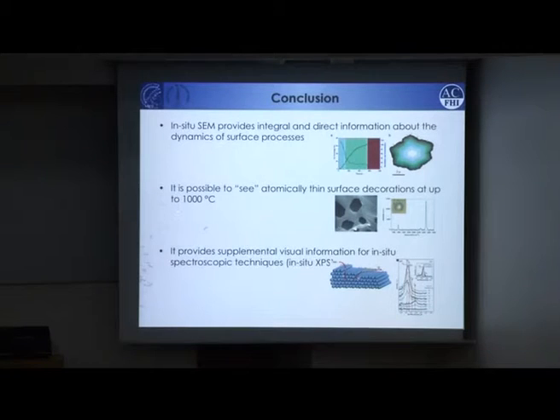There are lots of people fitting lots of peaks with different theories, but in the microscope that we have now, we can actually correlate the dynamics to the spectroscopy data. And that's basically the message I wanted to share.